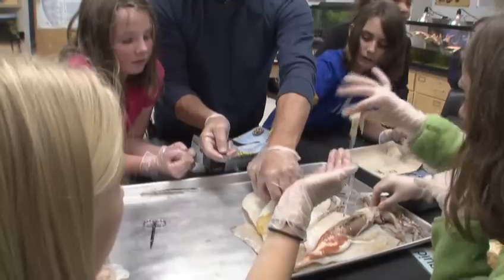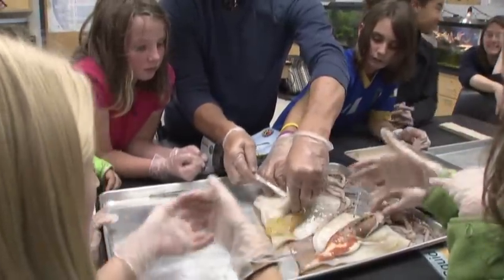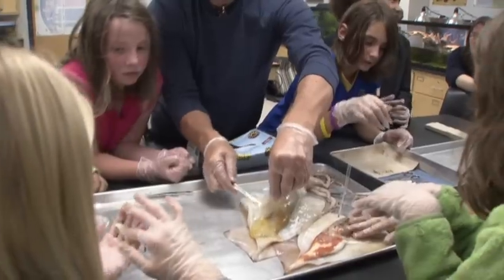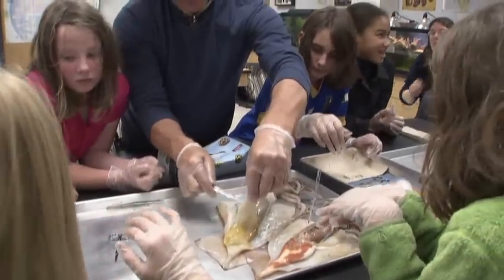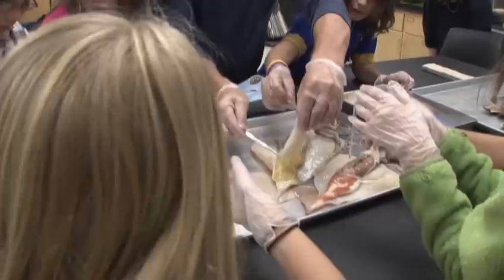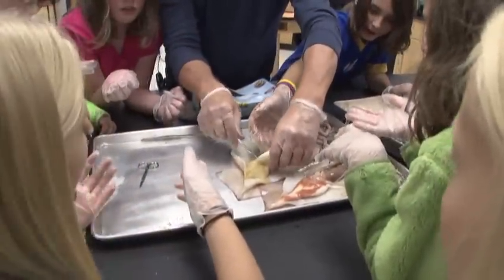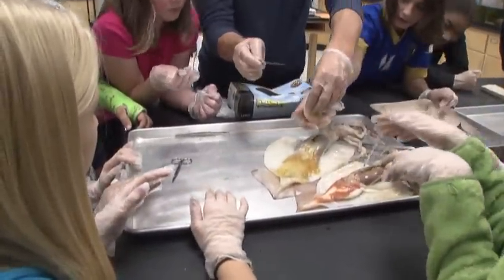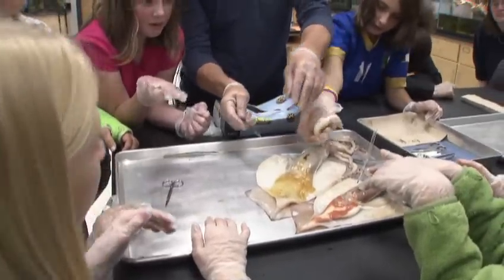Are we going to be able to cut apart anything? I'm going to open the nidamental glands. Yeah, you guys can cut open some of this stuff here. In fact, this digestive gland here. Sweet. That is sweet. This is the cecum. You see, this is digested food. You guys want to hold the nidamental glands and the ovarian ducts? Sure. Don't drip it though anywhere. Okay, you got it? Yeah.